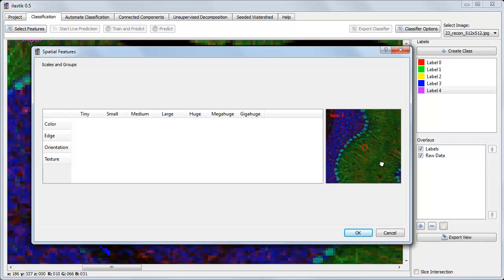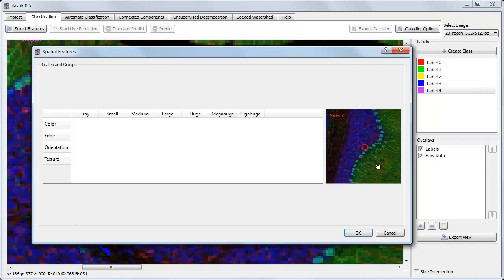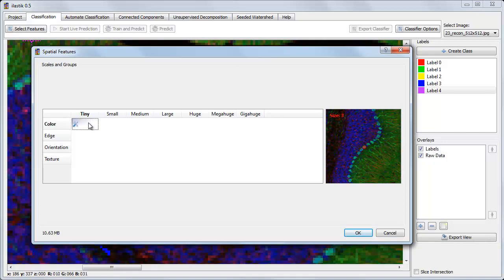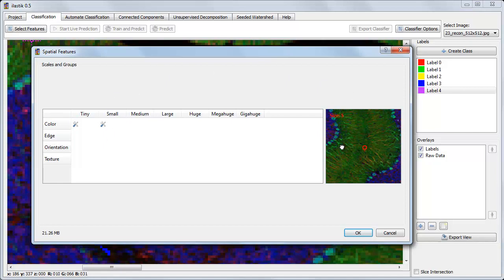So to calculate features for a very small structure, like this tiny light blue blob, it might make sense to use one of these tiny or small features. Whereas to identify this larger membrane region, we should use a slightly larger neighborhood.